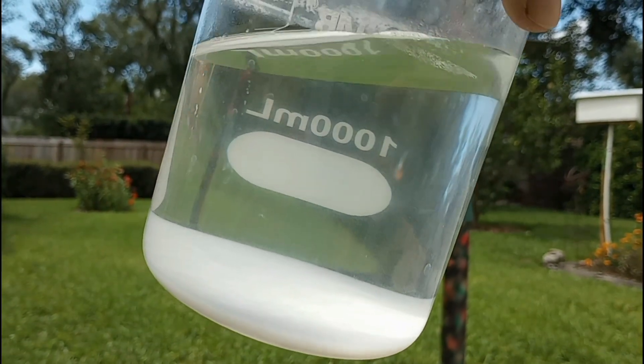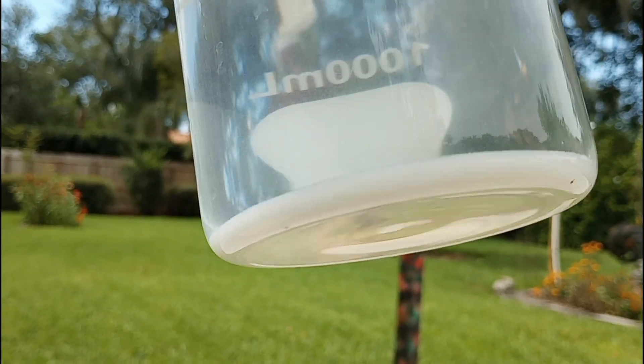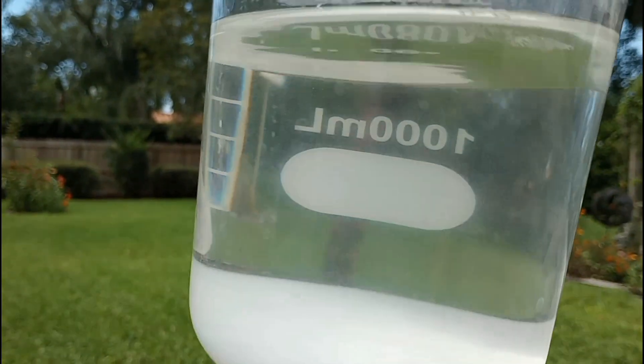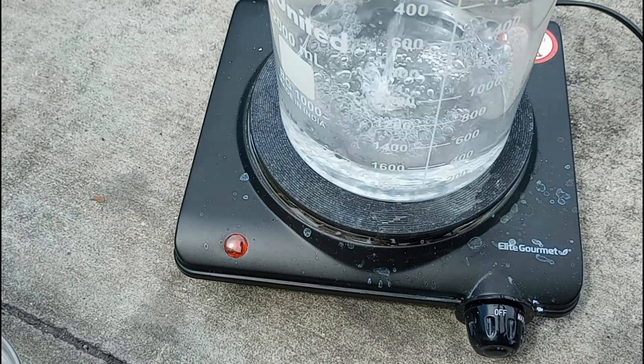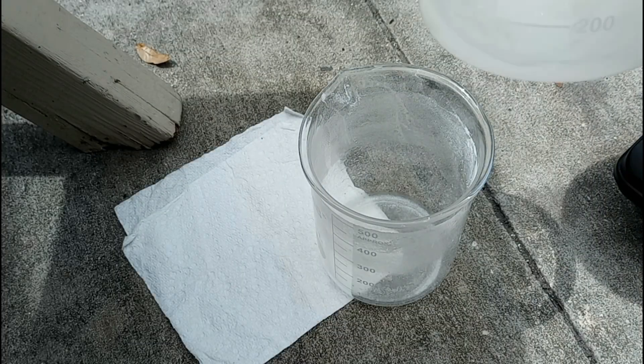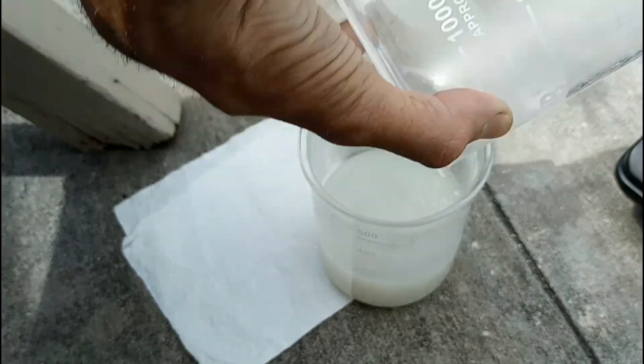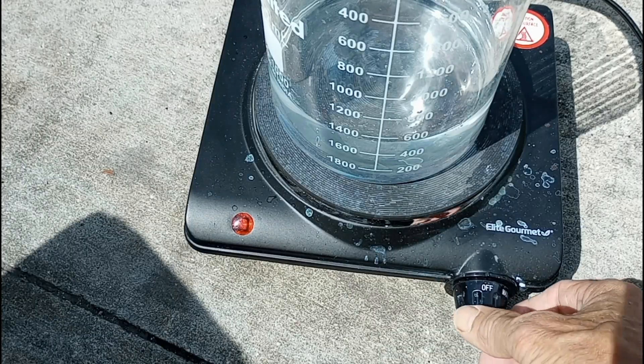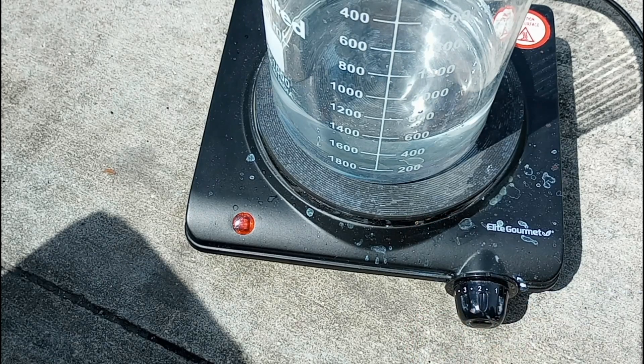It took about two hours to get what we suspected to be zinc oxide to settle to the bottom and leave us with a clear solution. Then we decanted off the suspected zinc acetate solution into the beaker on the super scientific hot plate. The zinc oxide was washed many times, and then we started reducing the zinc acetate.